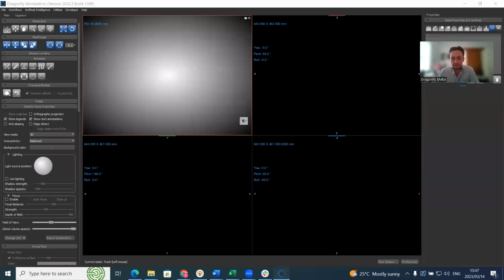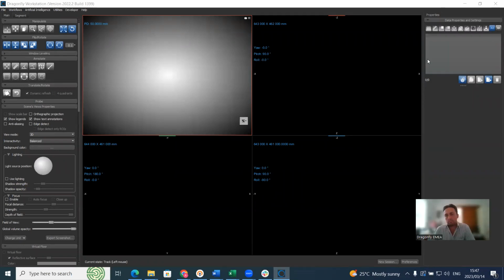Hi again. In this video, I'm going to show you how to do super resolution deep learning model training. Basically this can be useful for training a model to improve the contrast in an image recorded using poor resolution compared to a high resolution scan, which is acquired once, and then you can use that model on all subsequent scans at poor resolution. So it's a method that uses deep learning tools, almost like a denoising model.